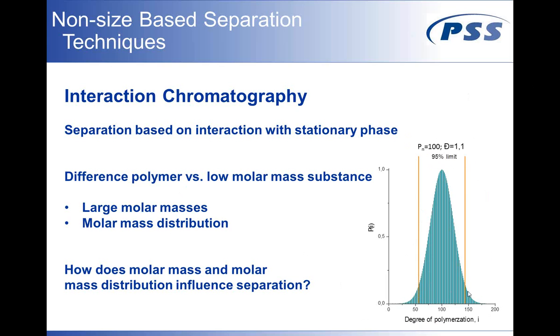You find molecules of all different chain lengths, 60 up to 140. So you have a large number of different chains which differ in their lengths. Here it's roughly in the order of 100 different species which exist in your polymerization.